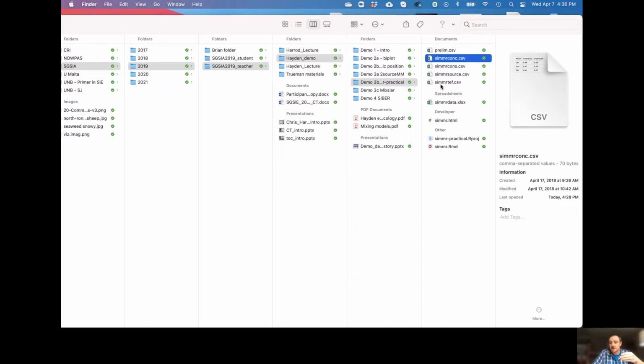Because the mathematics is more complicated, the package will do all that work for us. But the package, essentially the software, needs the input files in a particular format that it's able to use. So we have to make sure our data is put into that format, and then we give that to the package, and it can do the analysis for us.